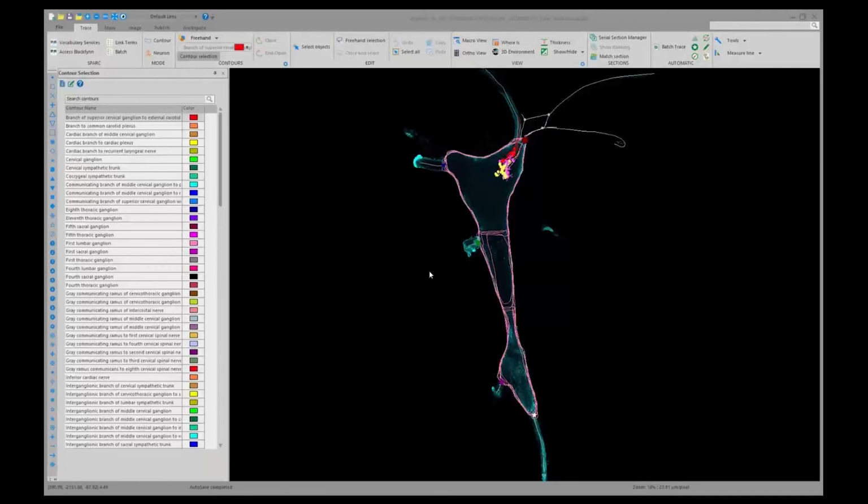So I just showed you how you can link terms and associate elements of your segmentation data with FAIR terminologies for one data file at a time. And now I want to show you how you can apply this process to many different data files at once.